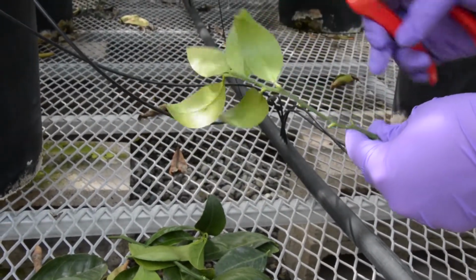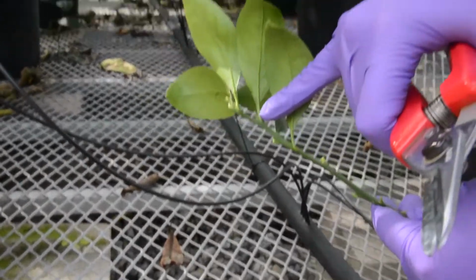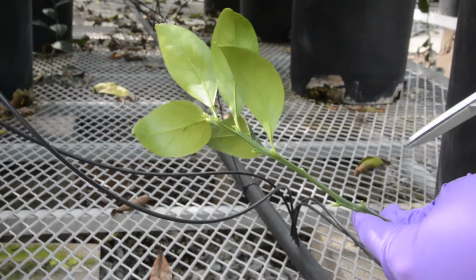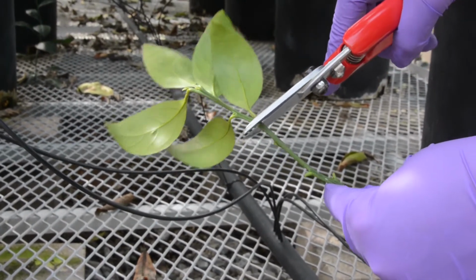And then I am going to cut off the top right here. If you can see, there are tiny little buds that are already pushing out, so I don't want those to be shipped to Fort Collins since they won't be able to use those. So I'm just going to go ahead and cut the top off right here.